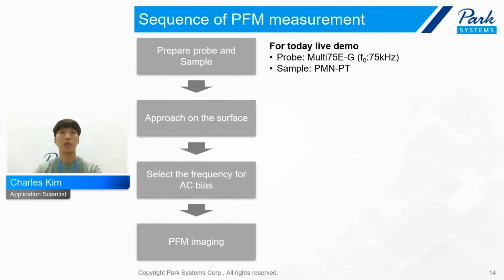So then how can we measure the PFM? There is a sequence of the PFM measurement. It's very simple. First we need to prepare the probe and the sample. And for today's live demo, I'm going to use the Multi75E-G probe. This probe has a 75 kHz resonance. And the sample will be the PMN-PT.